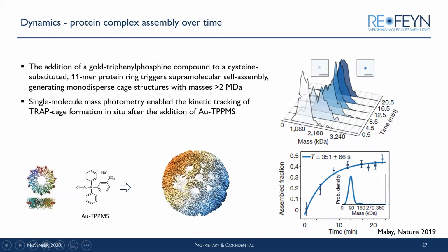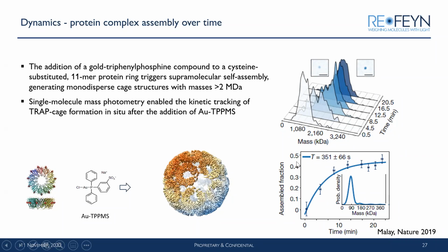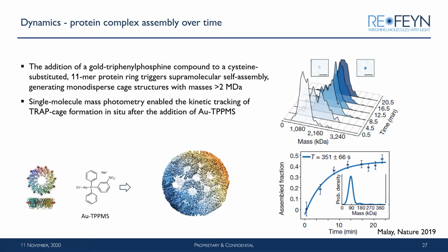Here you can see the shift in mass of the main species through a period of around 20 minutes, and you can quantify exactly the dynamics of this assembly. Here it's shown nicely. So this can be done also for virus assembly and for other particles.